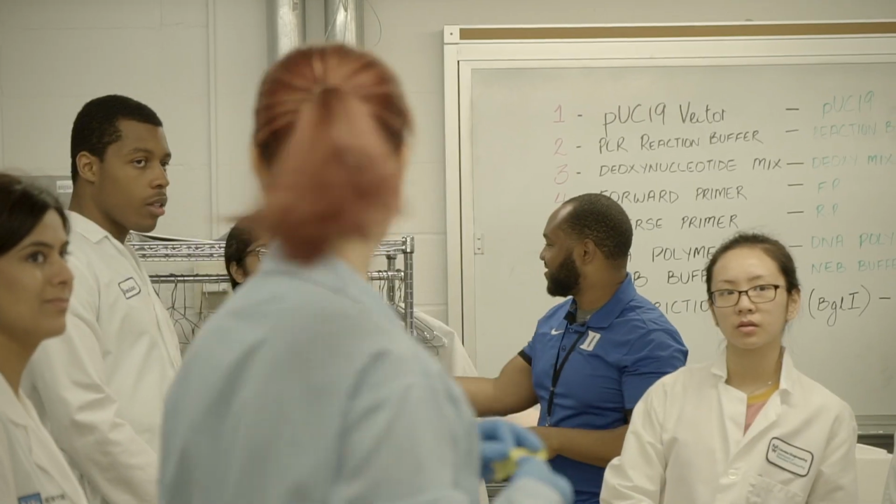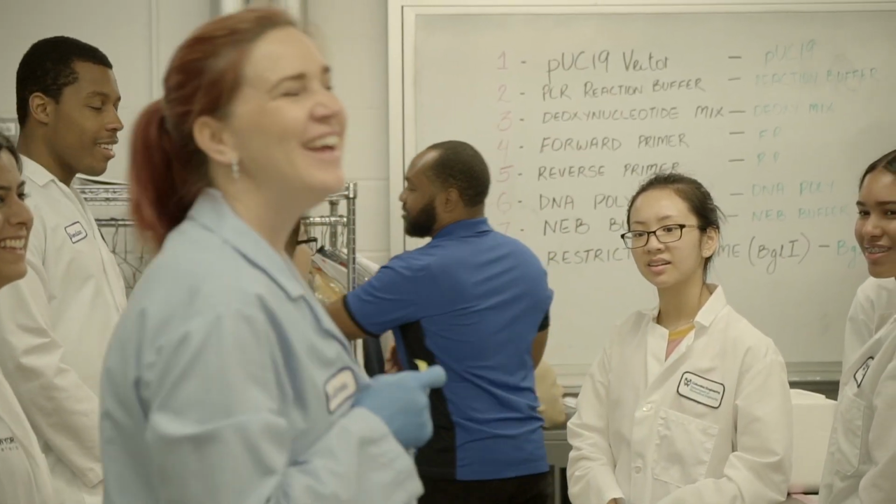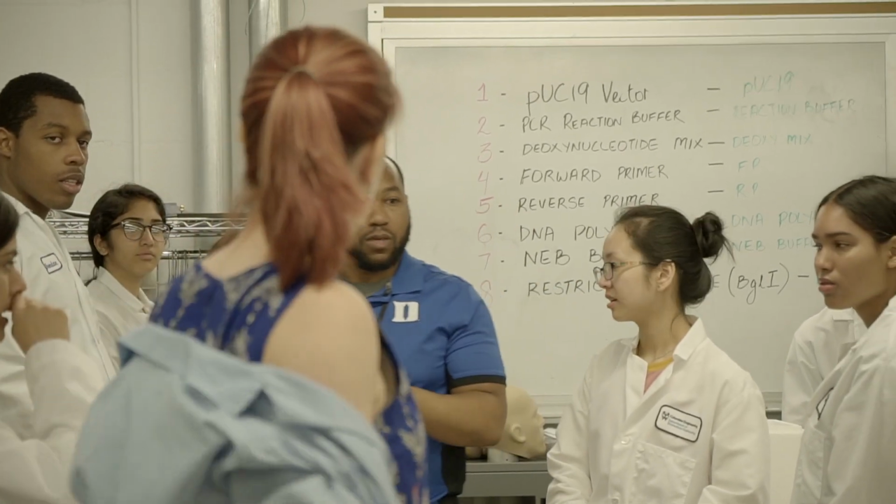experiments. So. Sure. And I just saw yours says Rachel. Oh, really? It was too small, so I did it one. Okay. So are we gonna have them just start following their? Yep.